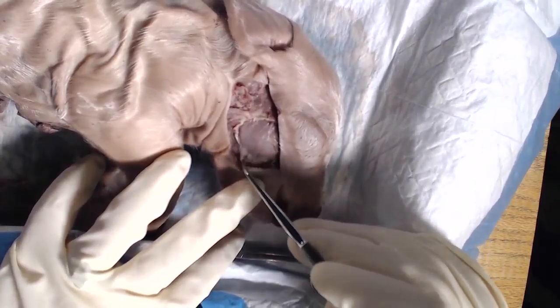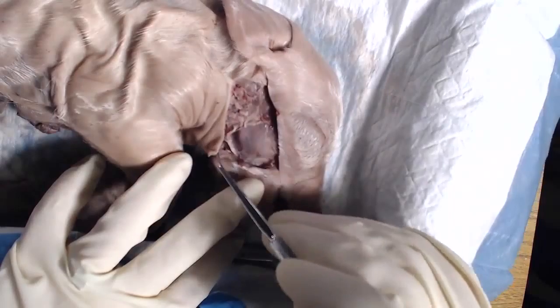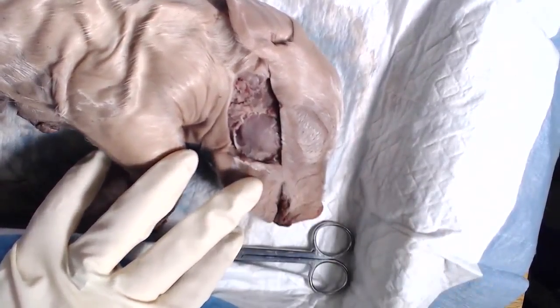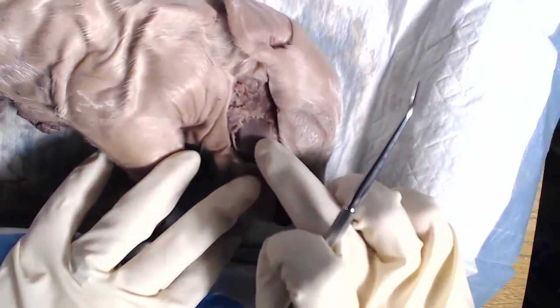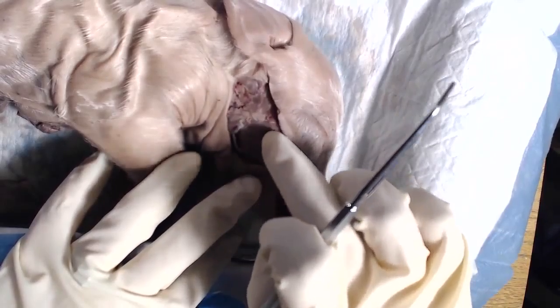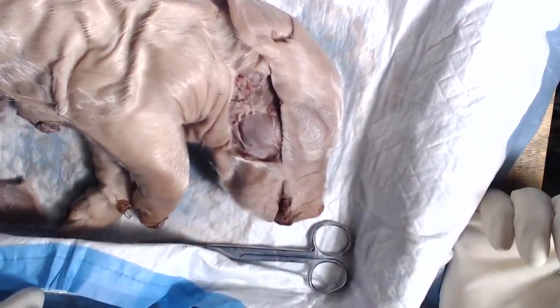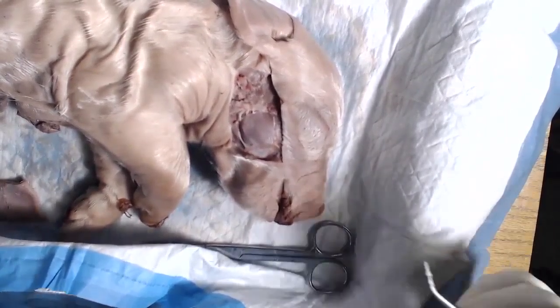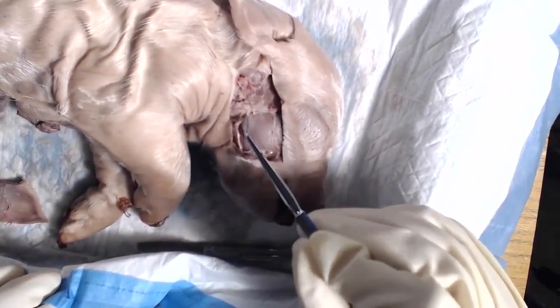This is what we were palpating first before we started our cuts. Okay, and you can go ahead and feel it. You can feel how it's a nice, firm structure. It's really large and round. And remember, this is the muscle that helps you chew or clench your jaw. That's the muscle that you're using.